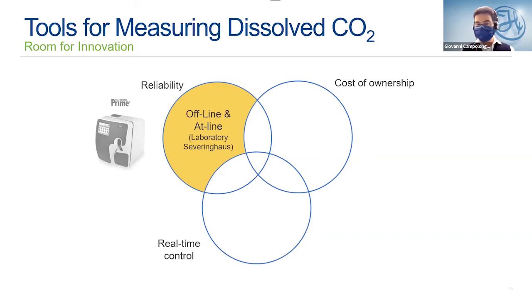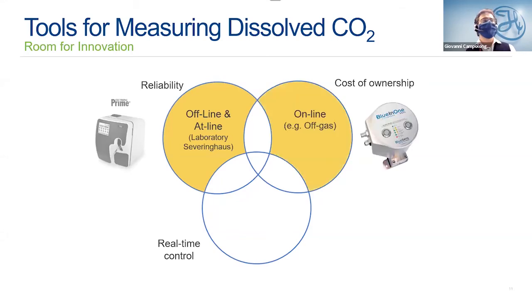Even when you do it with auto samplers, it will be simply too expensive. You know that they use cartridges, and even if you just measure every 10 minutes, the price of one single measuring point may be unsustainable. Let's just think how you can scale up to multiple bioreactors. So the reference method acts as the reference method. Maybe you measure that once per day. You think, okay, we need something that can have an affordable cost of ownership.